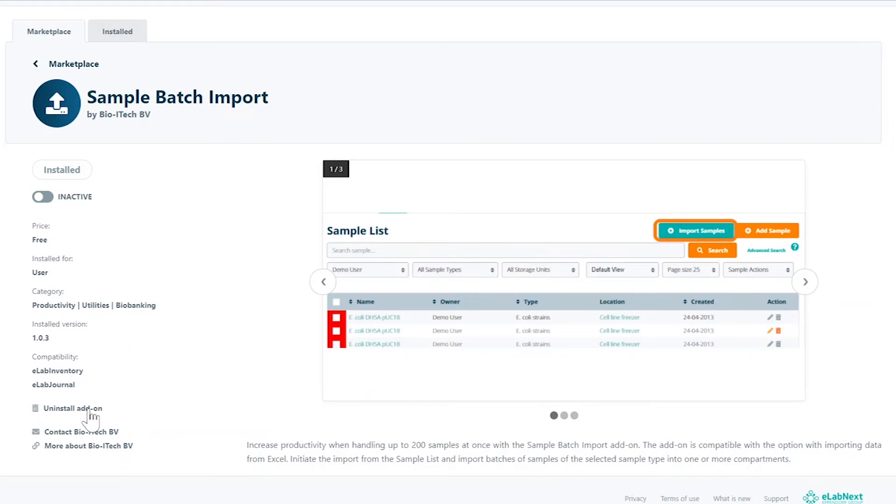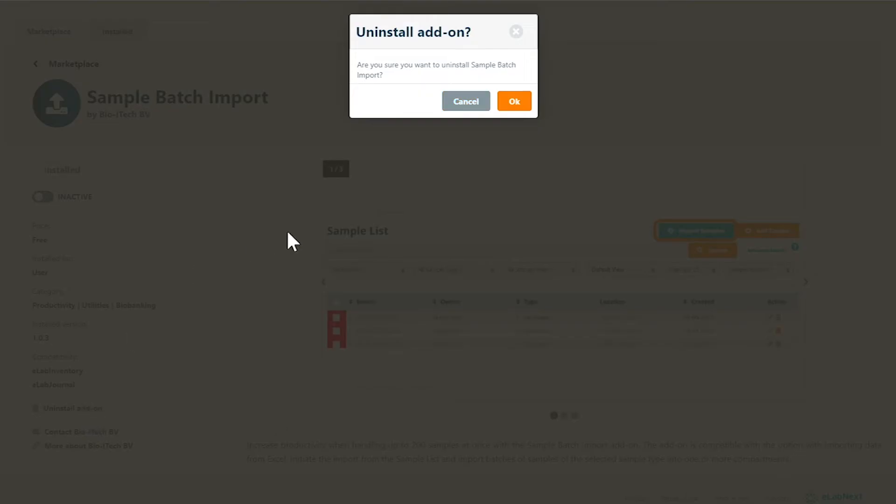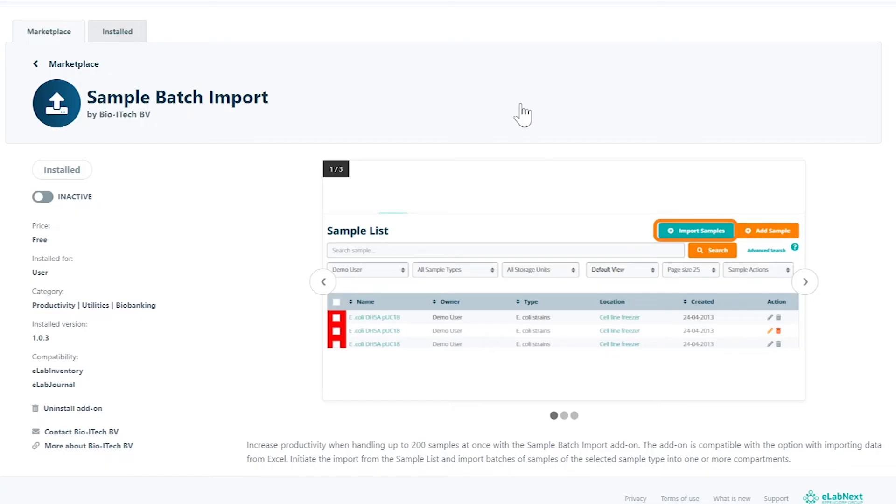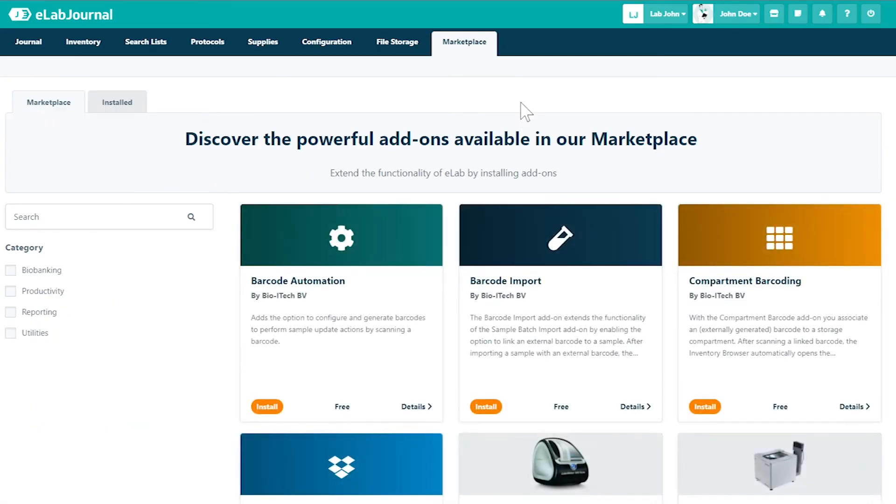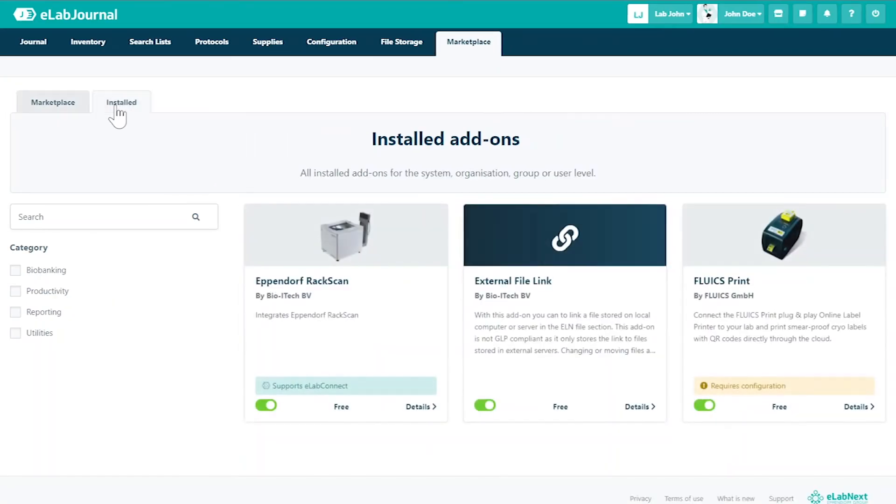You may also uninstall the add-on completely by clicking the corresponding button. Click the installed tab in the Marketplace to get an overview of your installed add-ons.